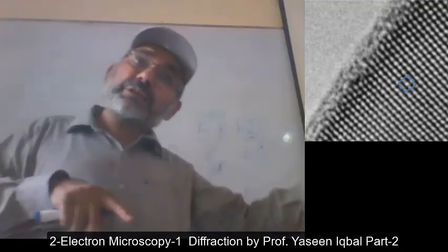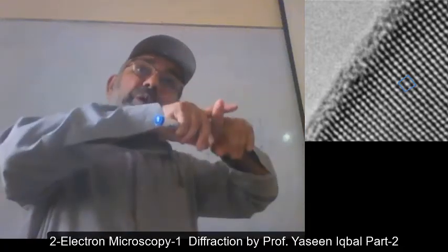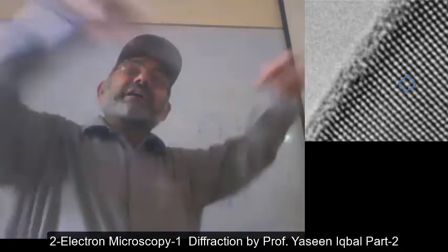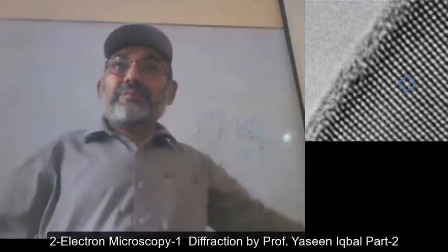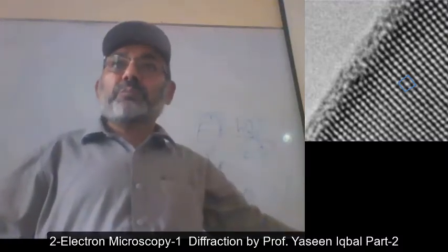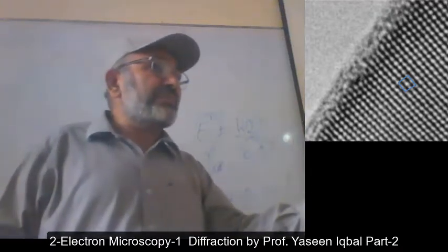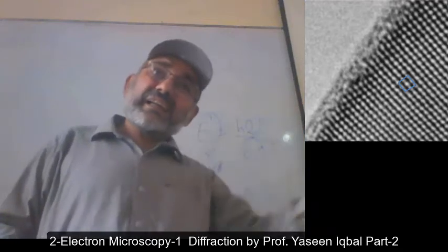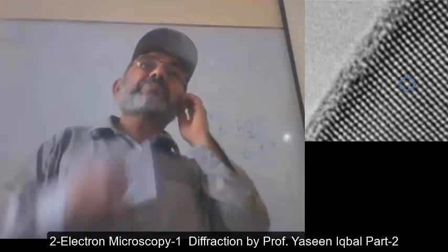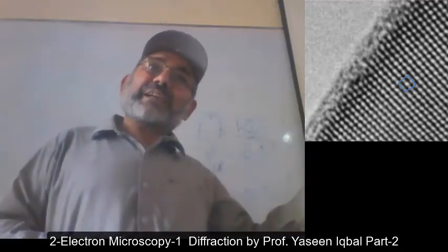You can't enter the unit cell, but you reciprocate it in such a way that it appears like a three-dimensional room, a cubic room, instead of the few angstrom size small unit cell. And that is the miracle of the diffraction pattern, right?